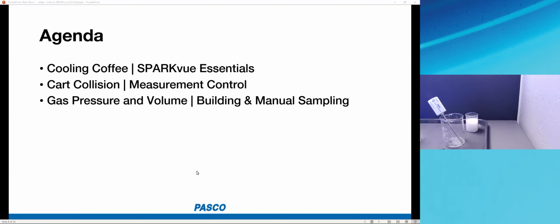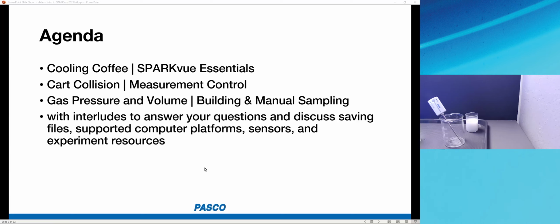So I'm going to go fairly quickly through these, but again, I welcome your questions, and you'll have the recording to refer back to if you want to walk through any of these at your own pace. We will pause occasionally to answer your questions, although Heidi will be taking care of many of those questions directly in the text window for Q&A. And we'll talk about saving files, the supported platforms for Sparkvue, various sensors supported by Sparkvue, and experiment resources where you can get labs that are ready for your students.